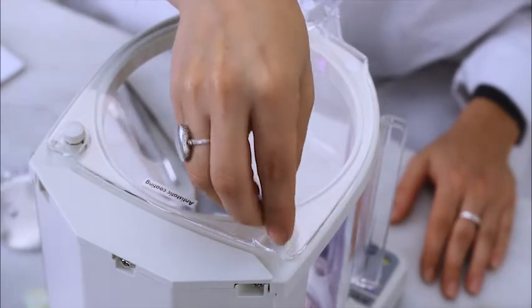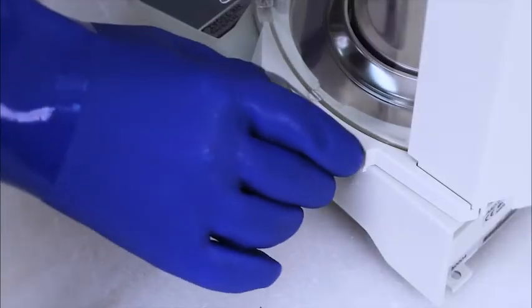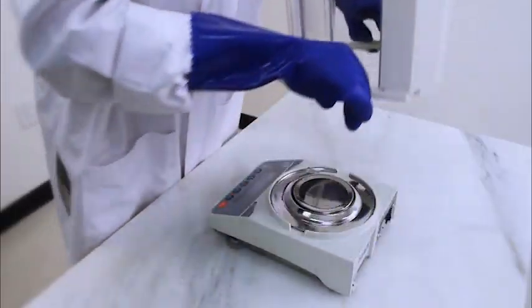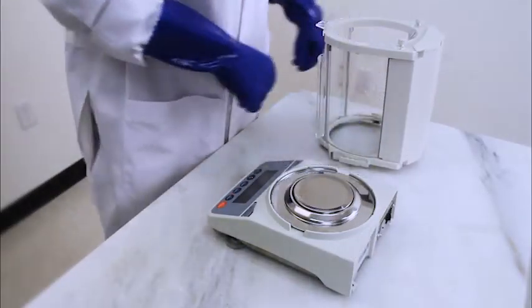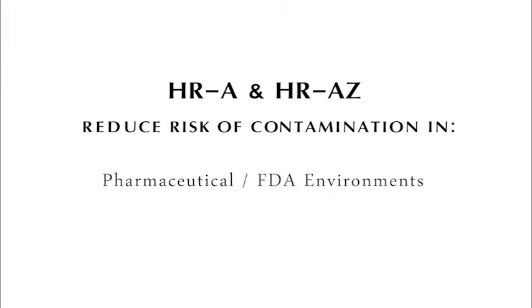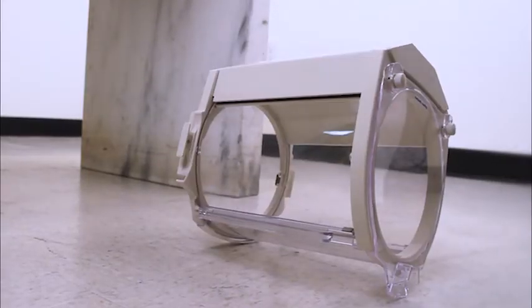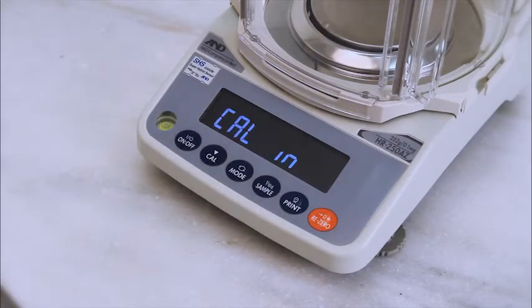The anti-static breeze break increases measurement accuracy, and it's easily detached even with heavy gloves to save you effort when cleaning. The HRA is safe for sensitive environments such as pharmaceutical and food applications. The shatterproof breeze break removes a common safety and contamination risk from the lab or production area.